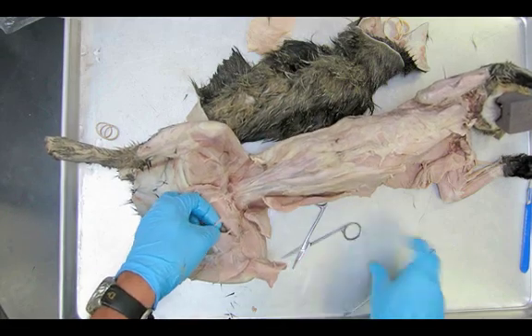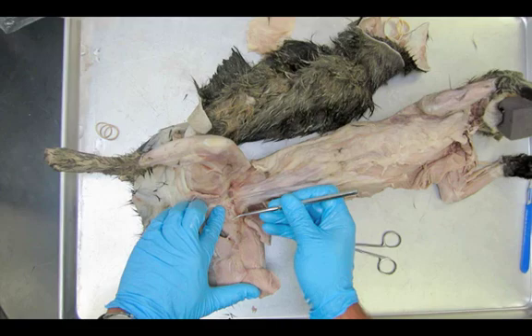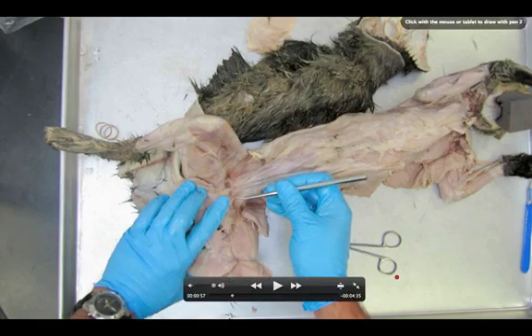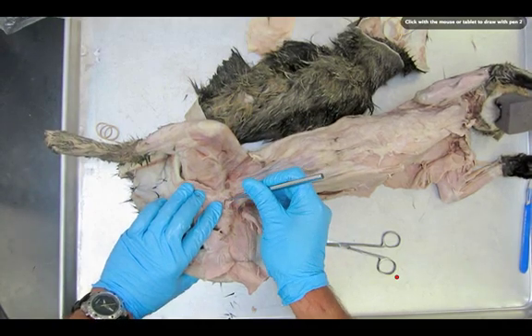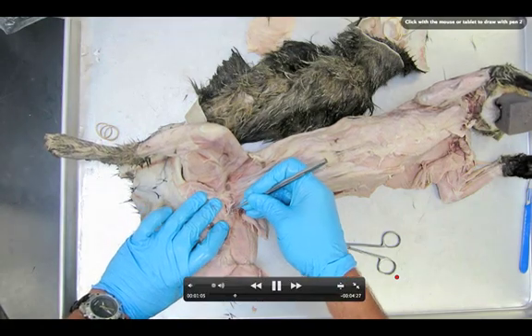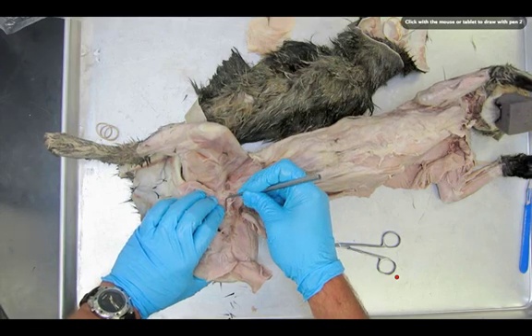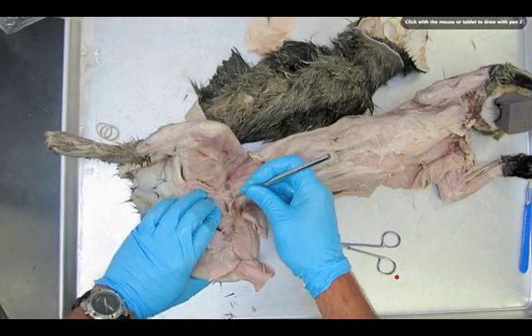We're going to use just our probe, being really careful. In this video we're going to leave a lot of these blood vessels intact. I want to warn you about a common pitfall. You'll see where I'm actually teasing apart — that is the end of the adductor femoris. Extreme caution is required during this part of the dissection as I carefully peel it away.